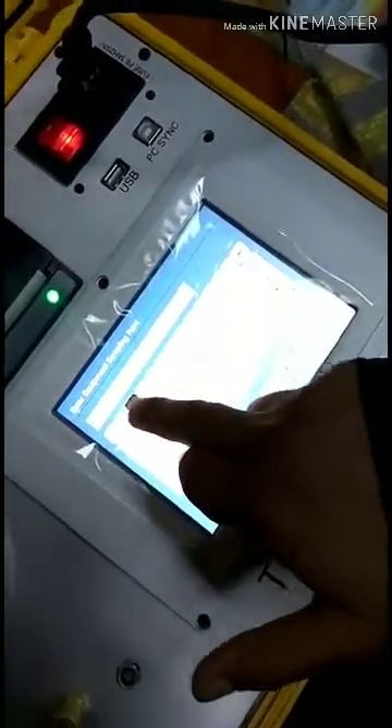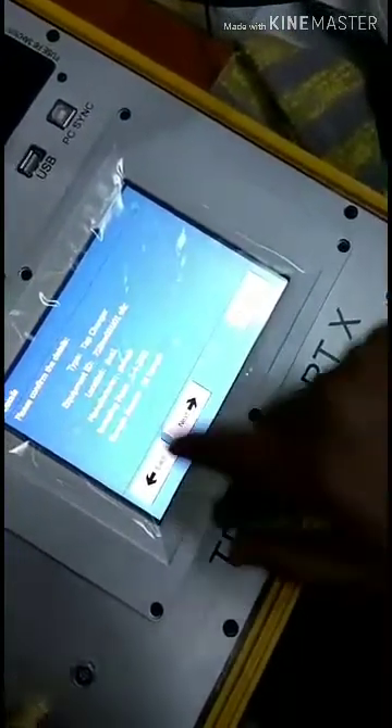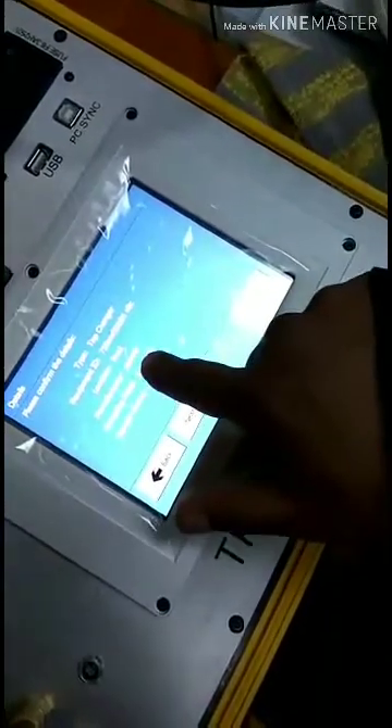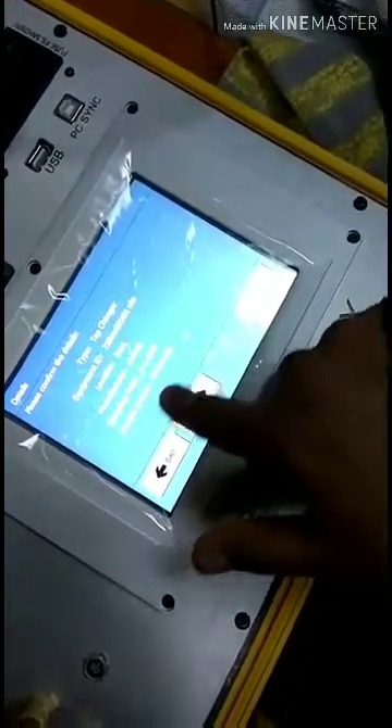Select this data. Sample it here. Next type: tap, change the equipment ID, location, manufacturer, sampling point, sampling source.